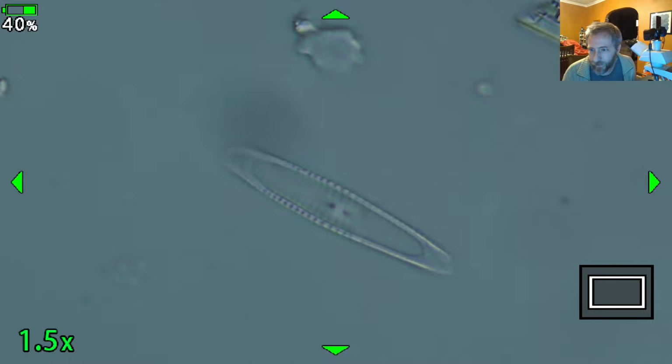Are they genetically the same? Yes, they're clones. Except for when they reproduce sexually, they exchange genetic material. And so those ones aren't clones anymore. Those ones are like any other population. They have sex and they don't clone anymore. So a lot of little things swap their reproduction methods around. Yeah, the rotifers and cladocera, like Daphnia and things, they all have weird reproductive cycles. And Hydra are the same way. Clone, clone, clone, sex. It's a cool structure for a lot of organisms.